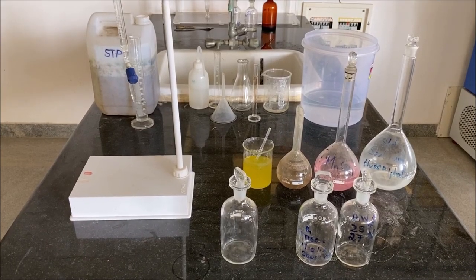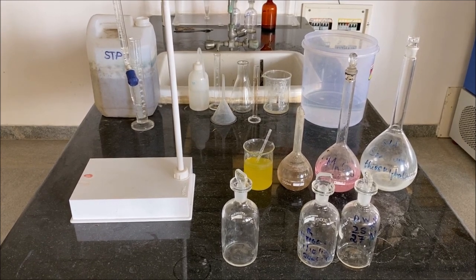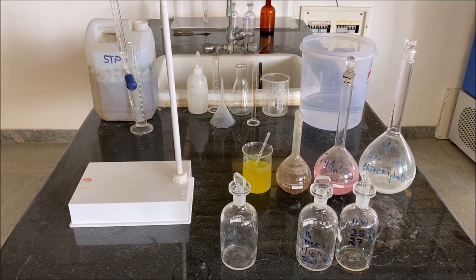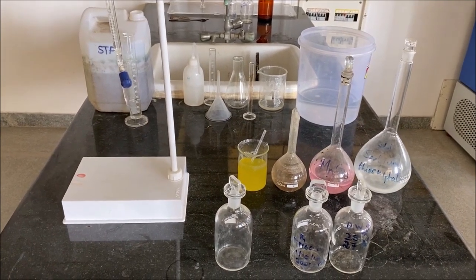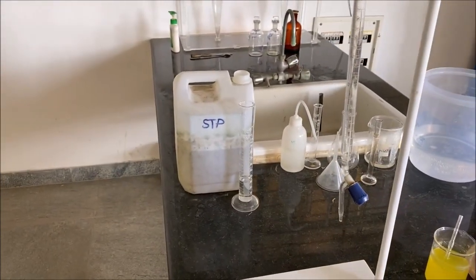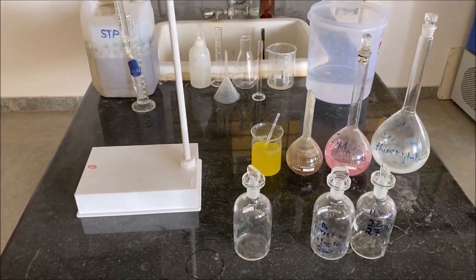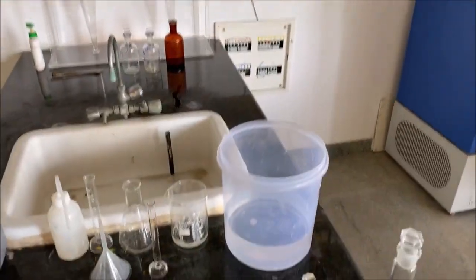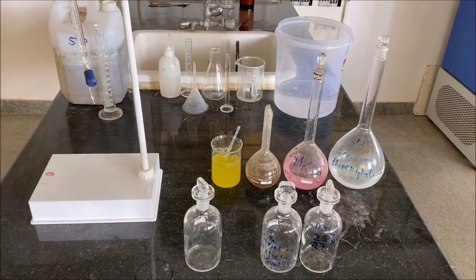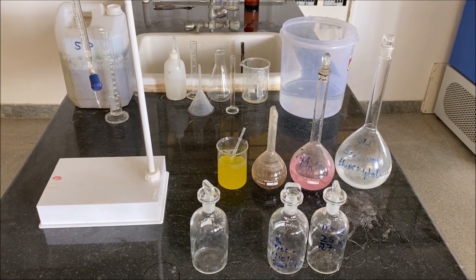Hi students, today we are going to determine BOD of the given sample. BOD means biochemical oxygen demand. In this experiment, we are going to consider STP water as the sample and we are going to consider aerated water or dilution water which we have prepared according to the procedure given in the lab manual.